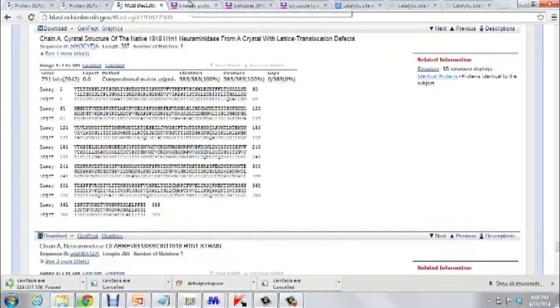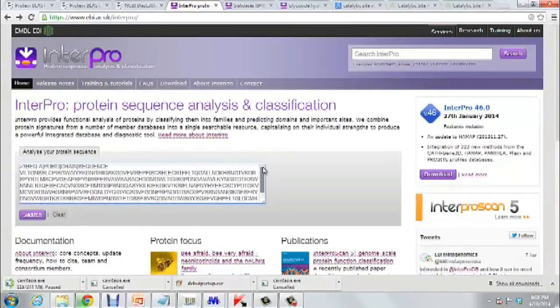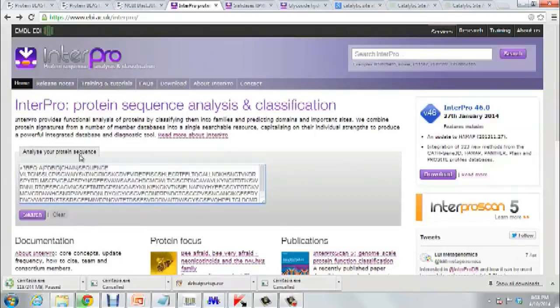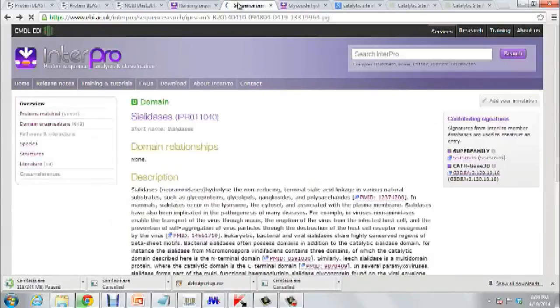We go to InterPro, we type it in Google or whatever search tool we want. We will have a box here, so we're going to use that box to paste in our protein sequence, the 3BEQA as well, and we're going to search it. Something like that is going to appear.